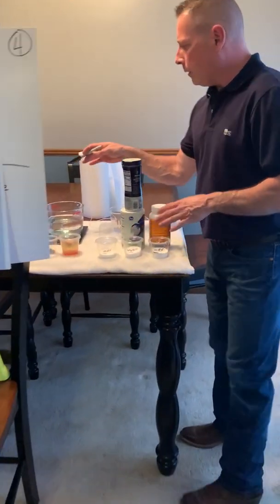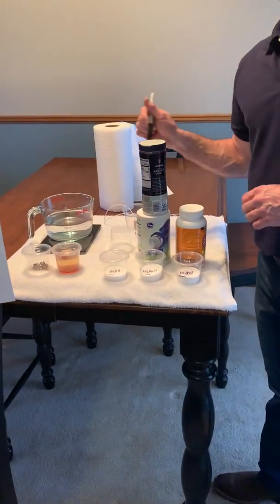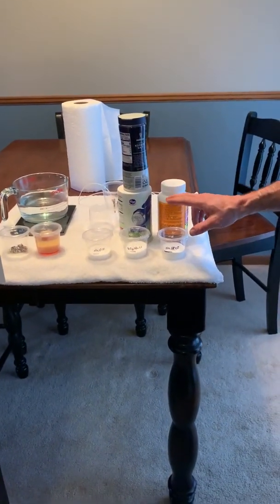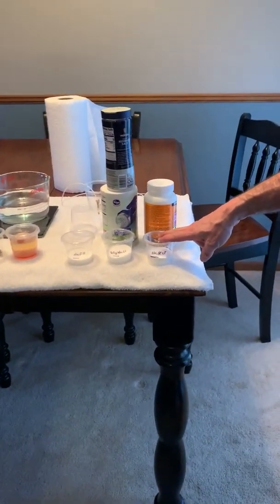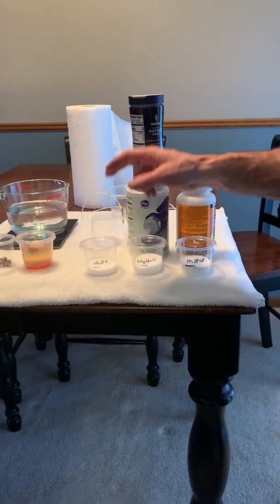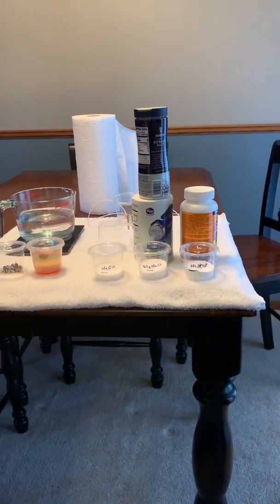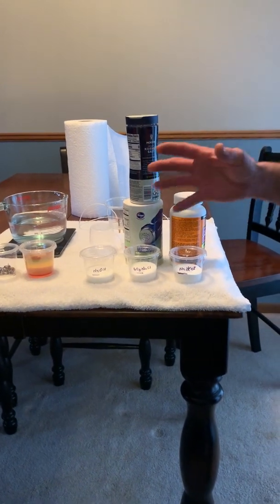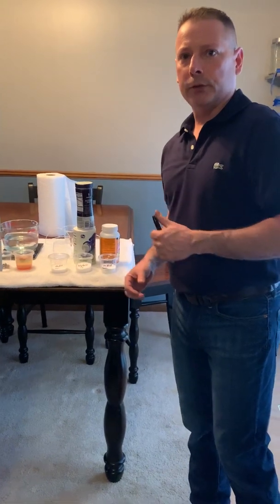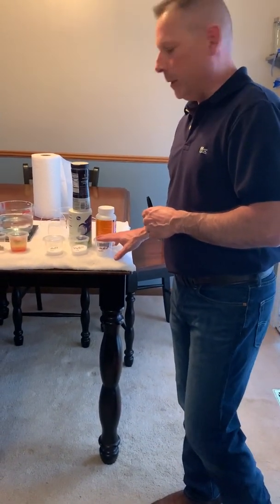So to do this, we basically take an electrolyte in water and we run electrical current through it. So I tried different solutions. I tried sodium bicarbonate, I tried salt, and I tried sodium hydroxide. What I found out best is sodium hydroxide worked the best. Electrically, through the process, it's much harder and takes a much higher voltage to break that element down.